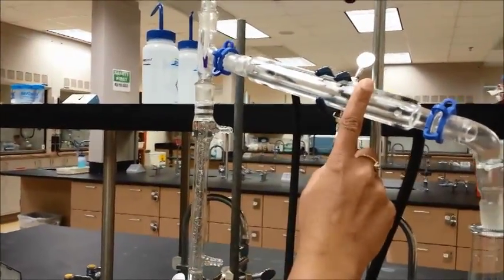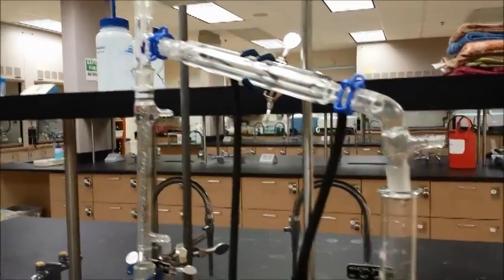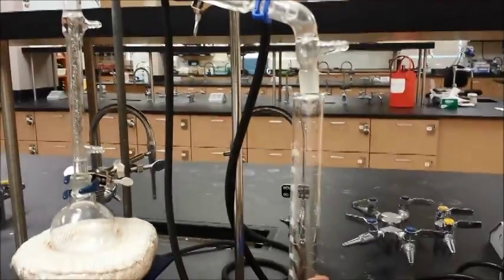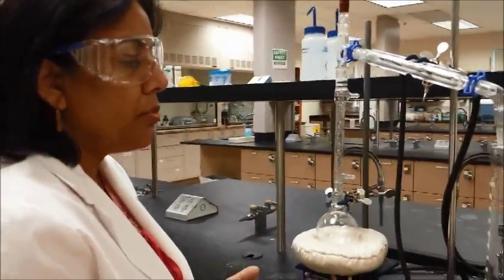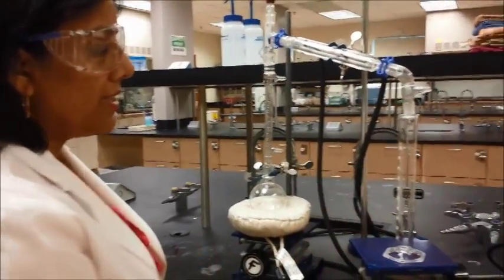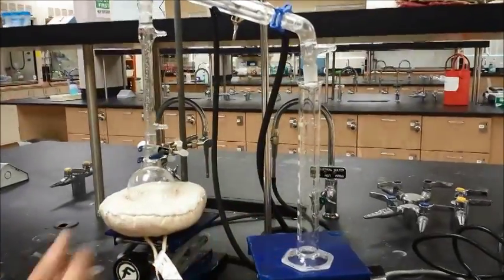You will still have the water running through the condenser, no problems there. You also need a collecting flask — for fractional distillations you sometimes will need to measure things, so you can use a graduated cylinder or you can use flasks.